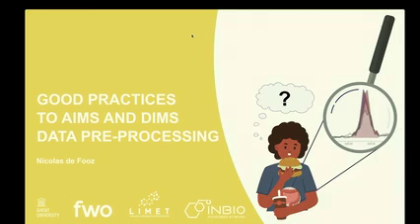Before we start, I would like to introduce to you Aidan. Aidan has indulged in quite some fast food over the last few months and years, and now he's wondering whether he might be at risk for developing severe health risks, obesitas, diabetes type 2. So to know whether he is at risk, we might use ambient ionization techniques to look for biomarkers.